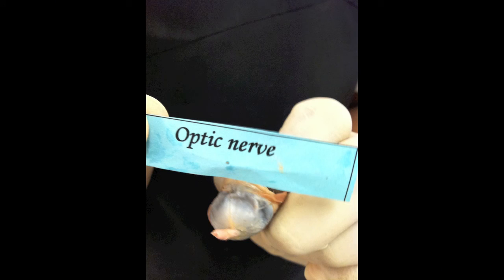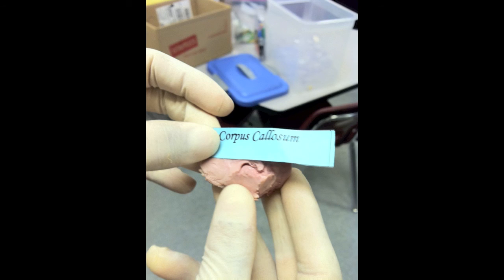The optic nerve transfers colors and messages to the optic lobe to produce a visual representation. The corpus callosum is the structure that aids in the communication between the left and right brain.